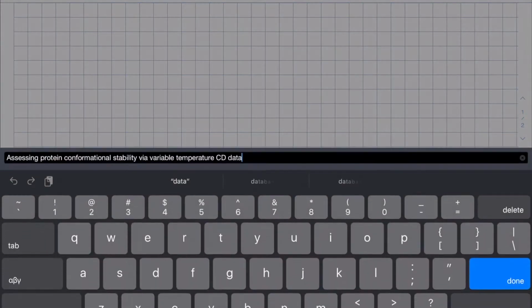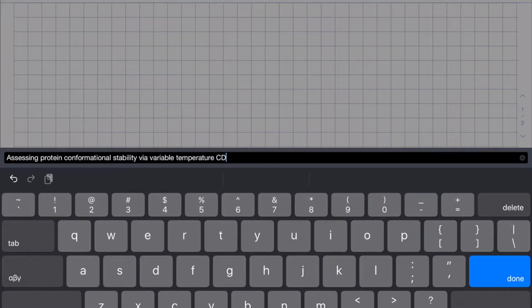All right, in this video we're going to talk about how to assess protein conformational stability using variable temperature circular dichroism. So first we need to talk about what circular dichroism is.